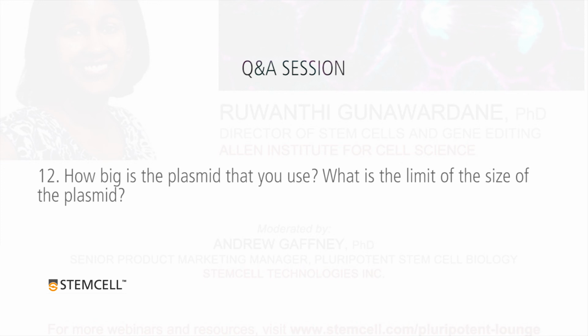Okay. How big is the plasmid that you use, or what is the limit or the size of the plasmid? I don't think there's a limit to the plasmid size because we're just electroporating it. I think it's about 5. It's pUC. It's about 5.7 kb.